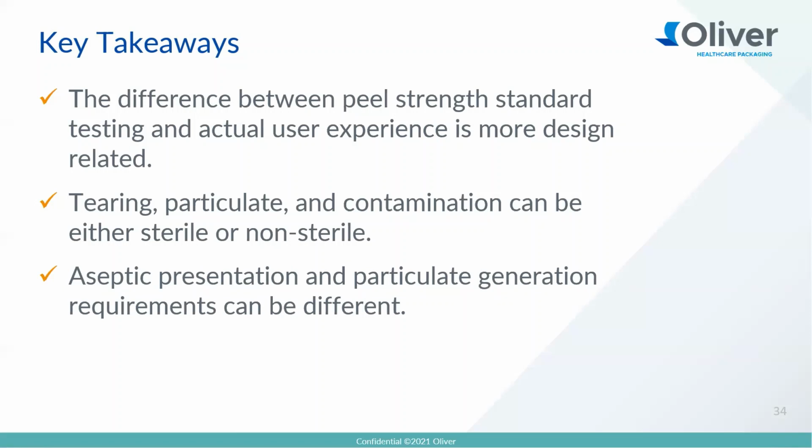And finally, on to the next one there, Jeff. From an aseptic presentation and particulate generation standpoint, the requirements can be different. So a clear understanding of the fundamental difference between aseptic presentation and particulate generation is key to decision making.